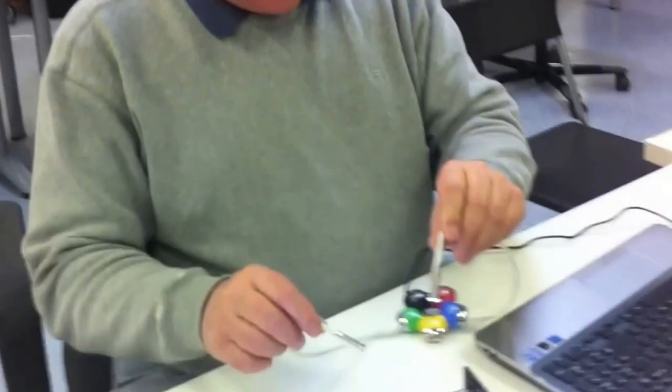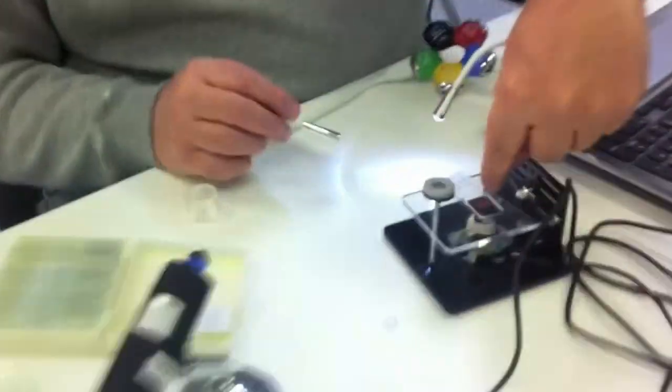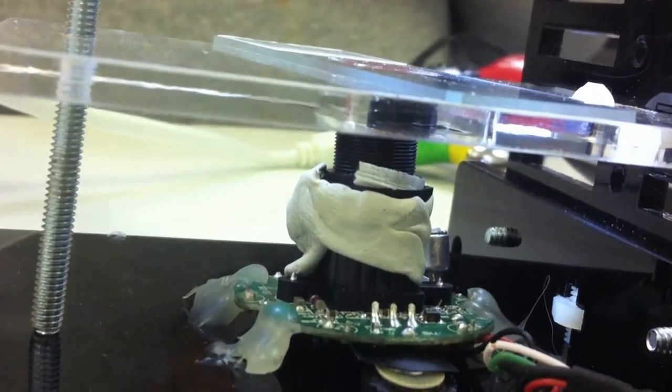So basically, you take a web camera, take the case off of it, and if you look closely in there — what I did was I took the lens off of the front of the camera, spun it out, flipped it over, and then glued it back down. When you do that, it becomes somewhere in the neighborhood of a 400 power microscope.